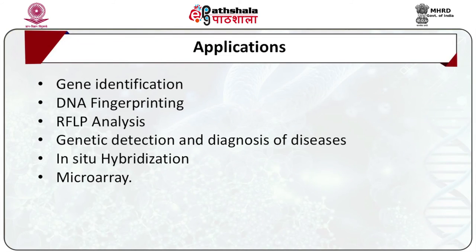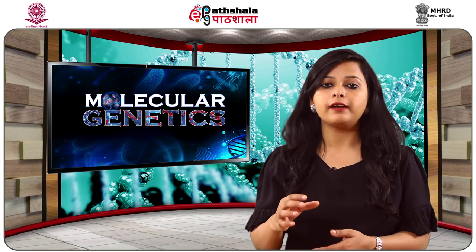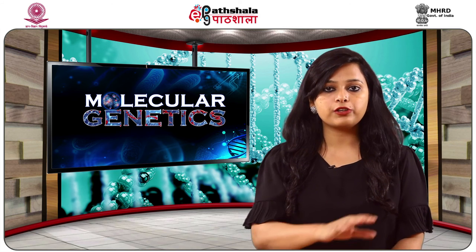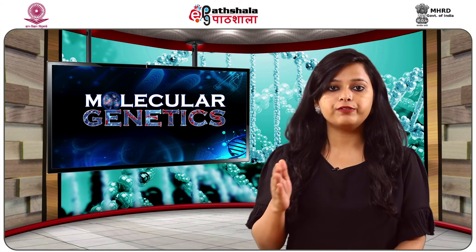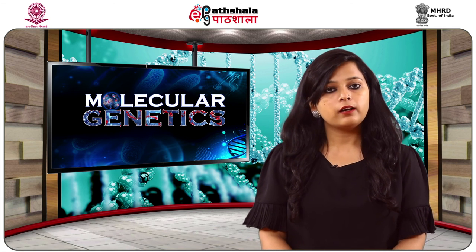Next is gene identification. Genomic libraries are constructed by digestion of genomic DNA and then cloning the fragments of different sizes in cloning vectors. These libraries are then screened using nucleic acid hybridization, which involves the use of specific gene probes to select the desired clone.